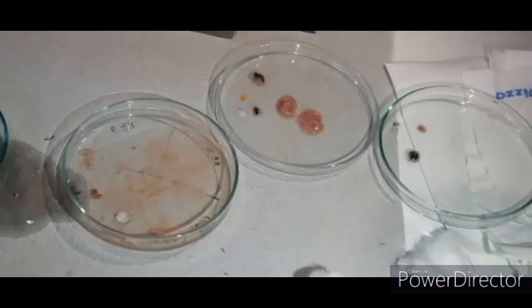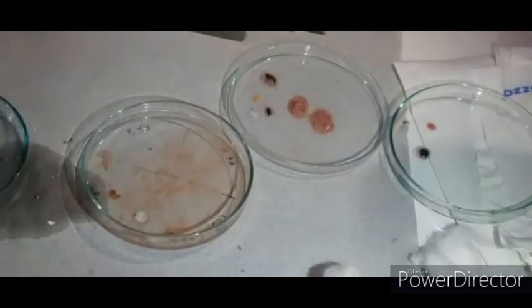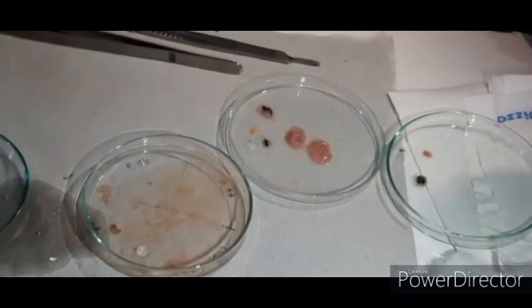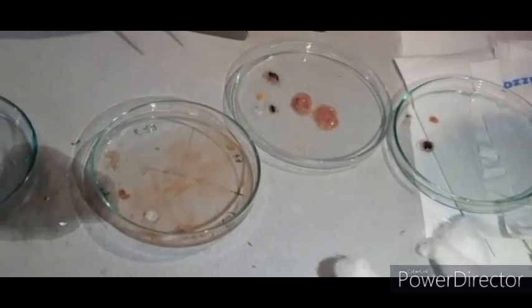Tissue-specific primary culture can be established by using these different organs. We have to keep the different organs in different test tubes and add trypsin to it. Keep them for 18 hours and then monitor the morphology by adding the medium, that is PBS or DMEM.